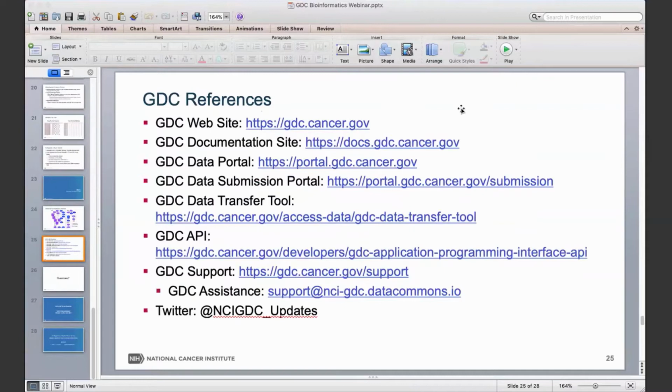The tumor-only pipeline has a unique requirement because the normal pair is not there. The issue is that because there are existing germline variants, we don't want the germline variants leaked into the somatic calls. The challenge here is how to remove that. So the new pipeline attacked this in two ways.